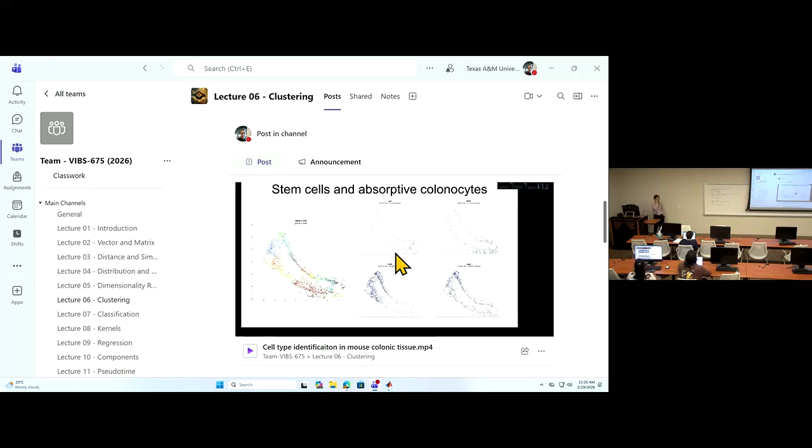So you know, okay, I would like to look at EPCAM, and you know, okay, that separates epithelial cells from non-epithelial cells. So that's EPCAM, a single gene that can help you separate them. And then you have to go inside. You know, okay, this is a differentiation node, and which is the stem cell. So you have to have that knowledge.